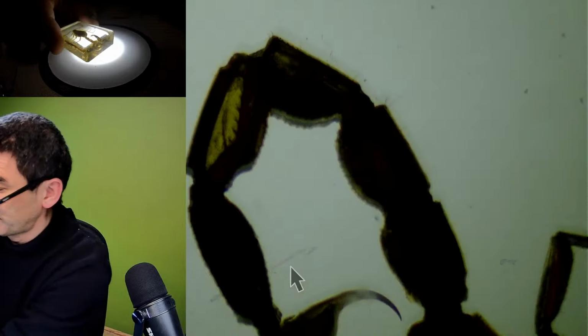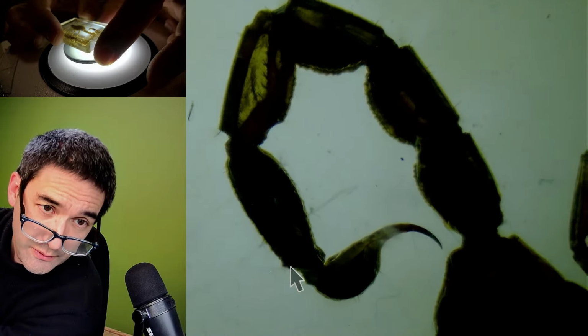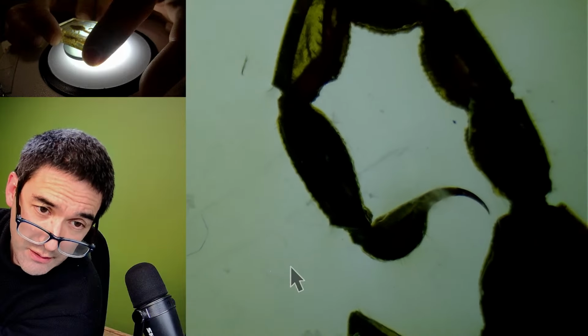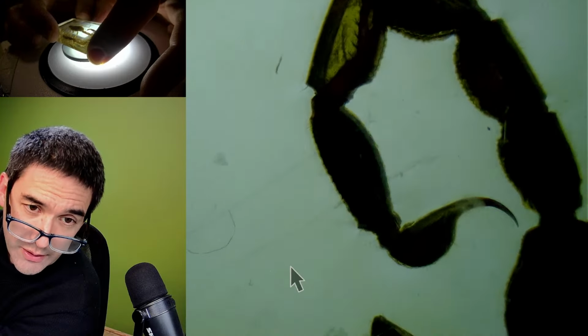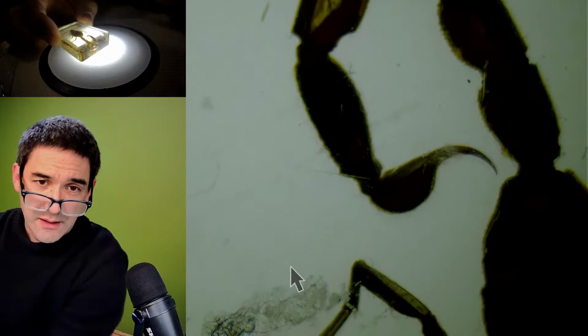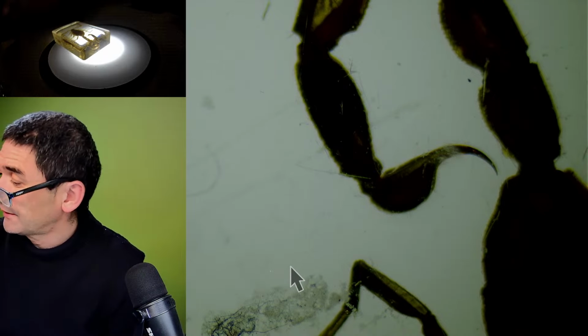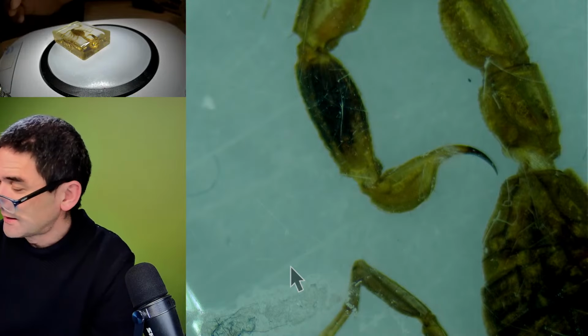What happens if I put a polarizing filter on the bottom? Then maybe I'm able to, because the epoxy might also add a little bit of color this way. Yeah, I guess I'd have to experiment around a little more with that. Let's turn off the bottom light and turn it on from the top again. So yeah, that's still a little bit better.